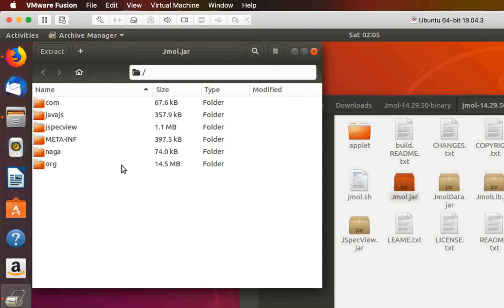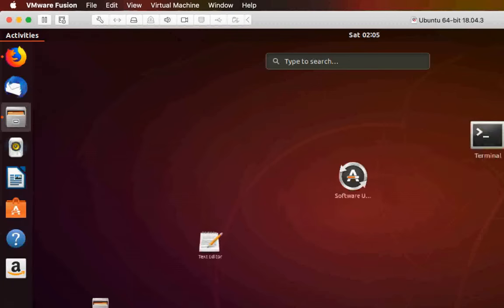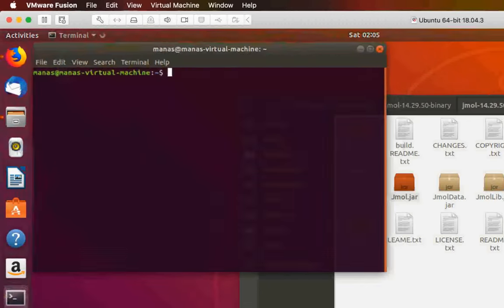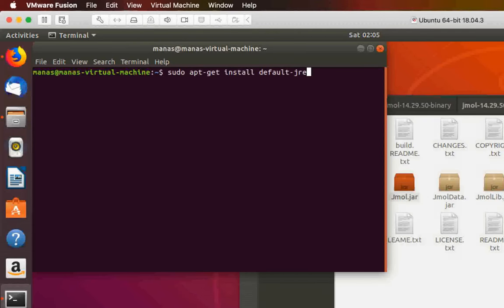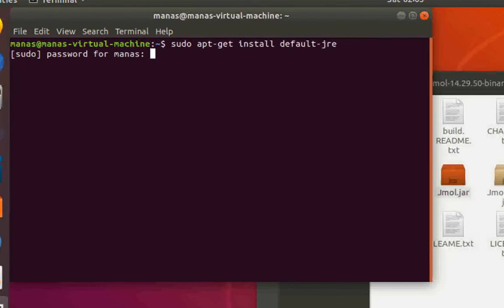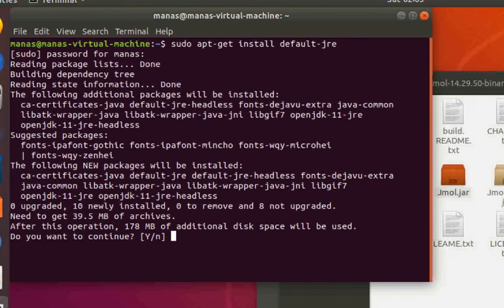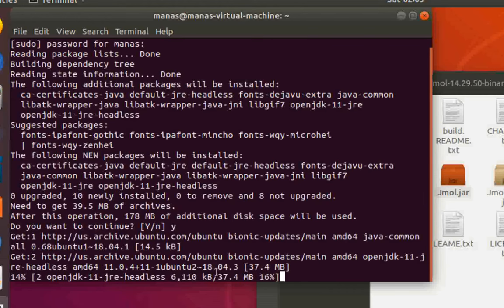In order to get this to run, you need to open the terminal, make sure you're connected to the internet, and install Java by giving the command: sudo apt-get install default-jre. Then enter your password and click yes to install it.